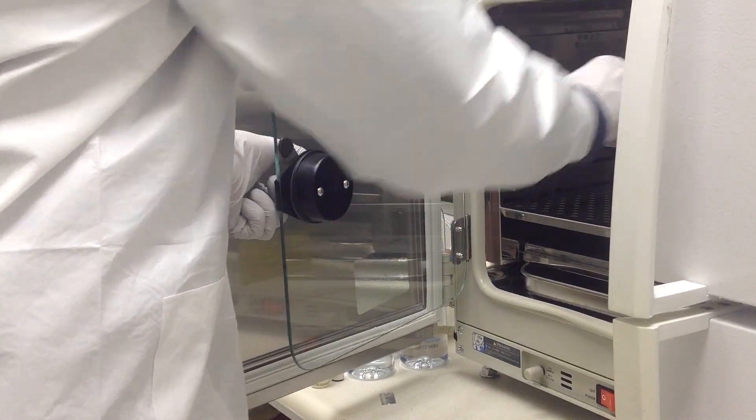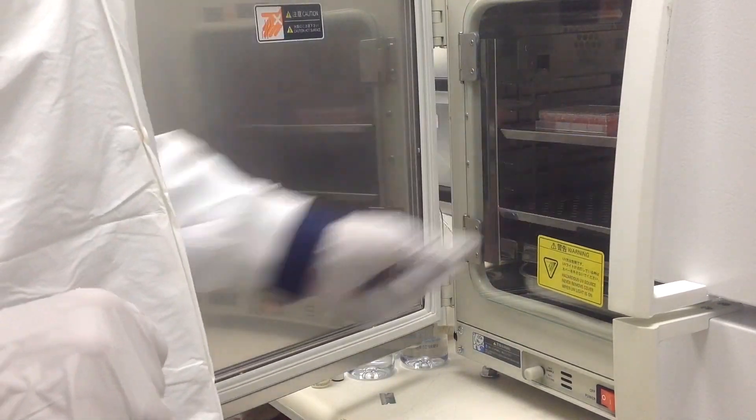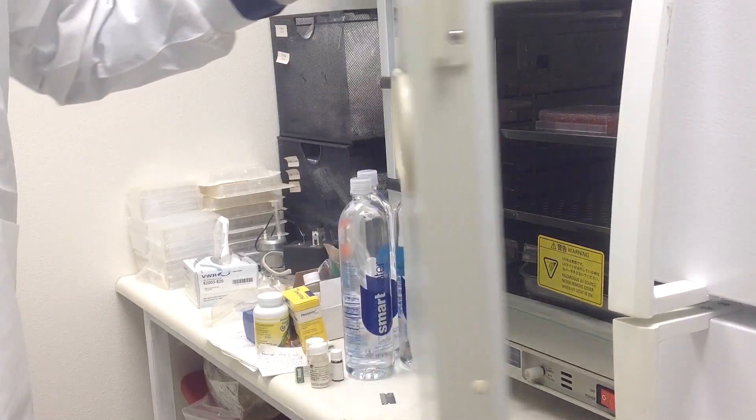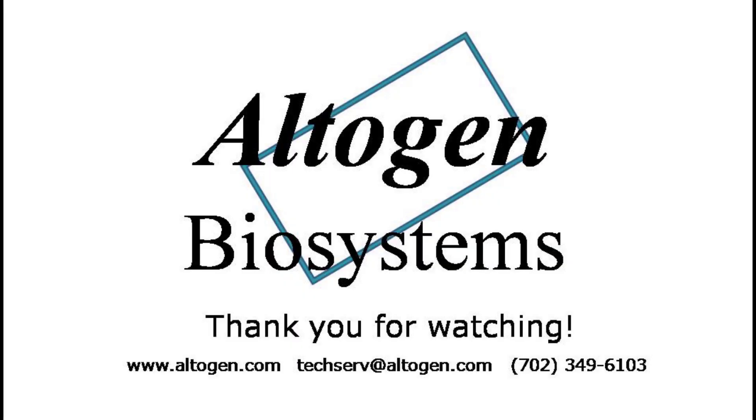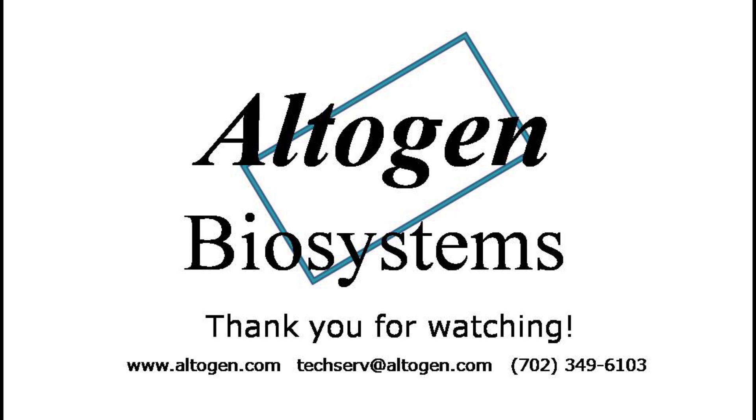Assay for phenotype or target gene expression 48 to 72 hours post-transfection. Here is a Western blot validation of our transfection reagents. L6 cells were transfected with either cyclophilin B DNA, which resulted in overexpression compared to non-treated cells, or cyclophilin B siRNA, which resulted in knockdown compared to non-treated cells.